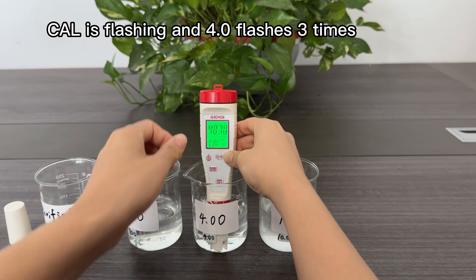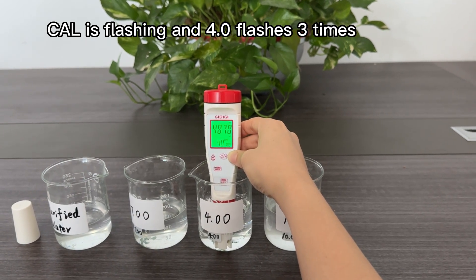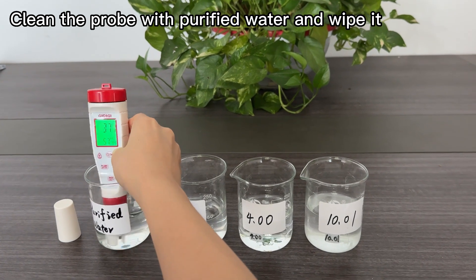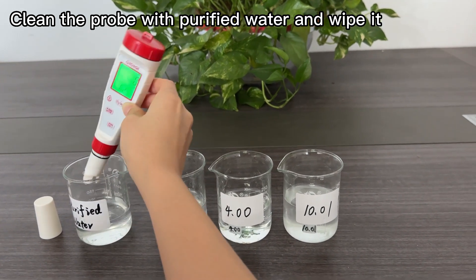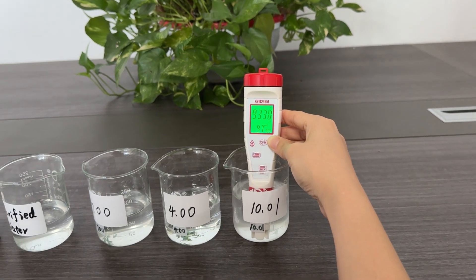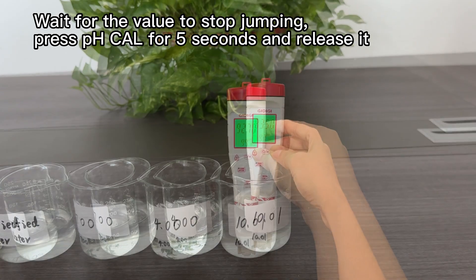CAL is flashing and 4.00 flashes 3 times to confirm calibration. Clean the probe with purified water and wipe it. Put the probe into the 10.00 solution and wait for the value to stop jumping.